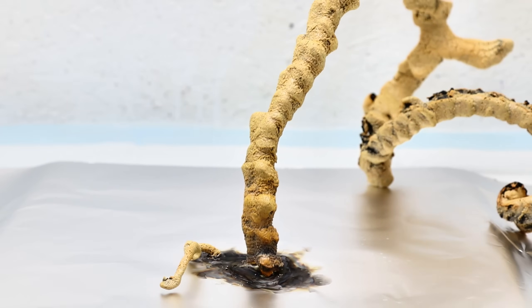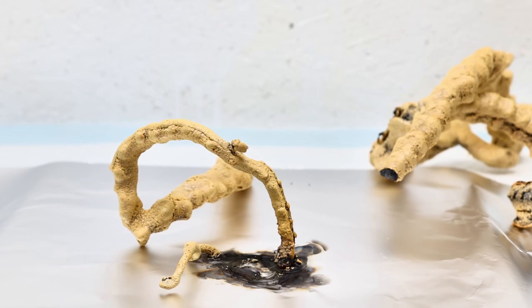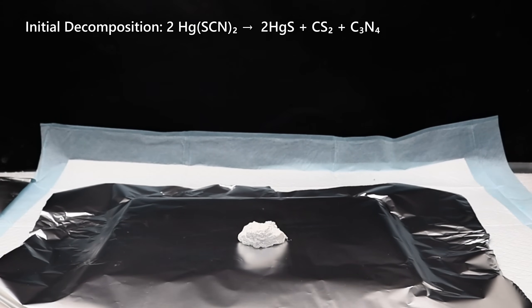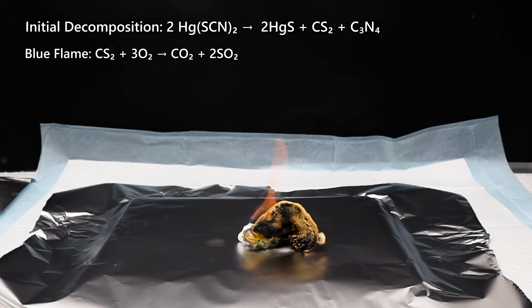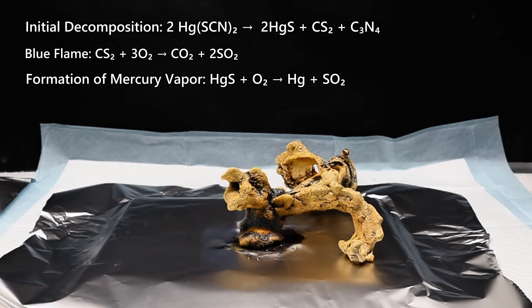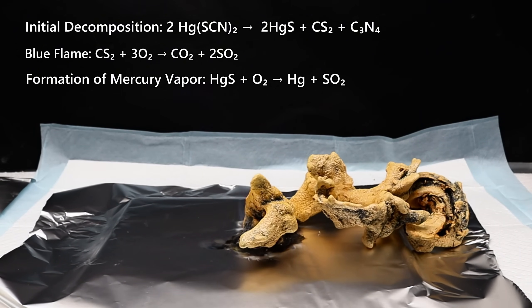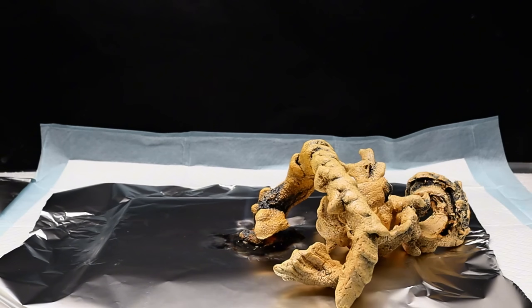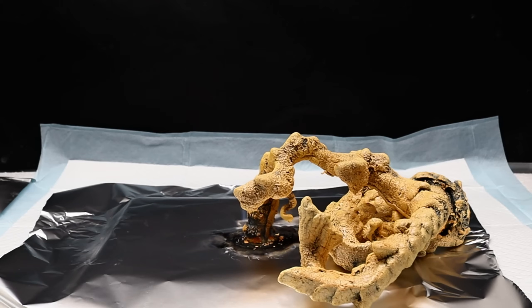While this is clearly the coolest step of the whole process, it's actually the most dangerous, due to the different reactions going on here. When mercury thiocyanate thermally decomposes, it immediately forms mercury-2-sulfide, carbon disulfide, and yellow carbon nitride. The carbon disulfide will next react with oxygen in the air to form carbon and sulfur dioxide, which is the cause of the distinctive blue flame. Meanwhile, the mercury sulfide will also react with oxygen in the air, forming more sulfur dioxide alongside mercury vapor — the truly hazardous part of the reaction. While most of the mercury vapor will immediately recondense inside the snake, a significant amount is also released into the air. If this reaction is done inside a closed container, a gray film of elemental mercury will condense to the walls of whatever container you use.